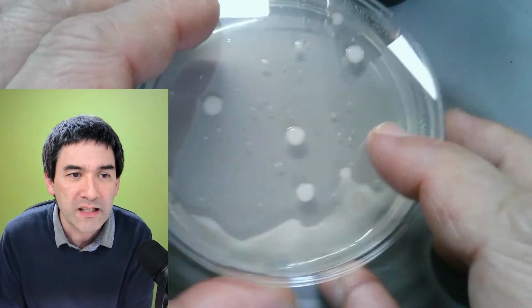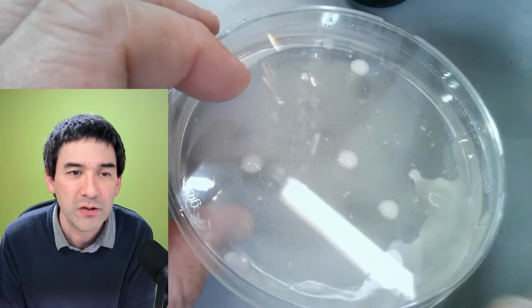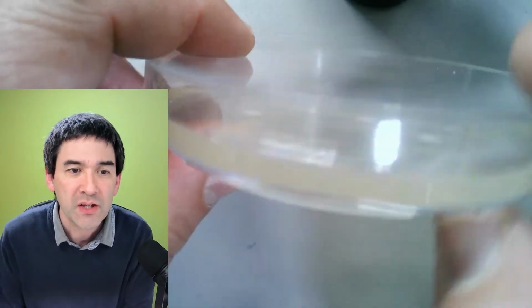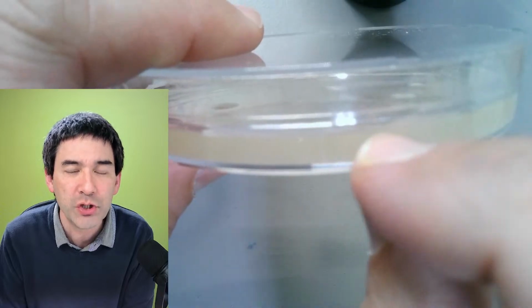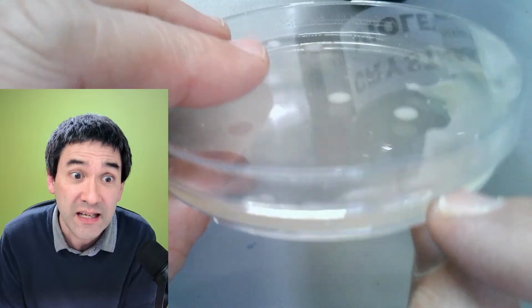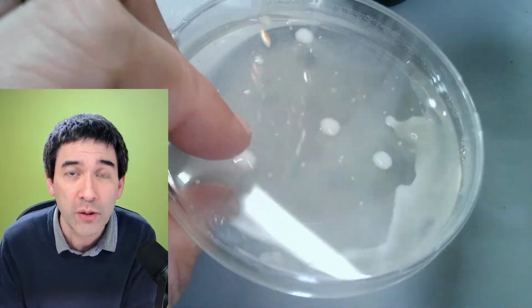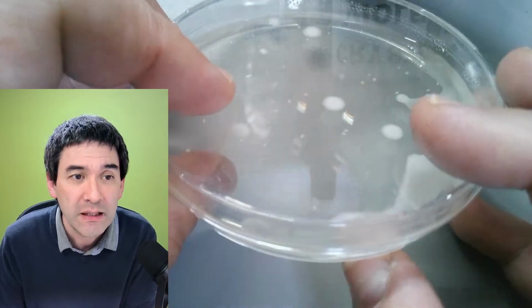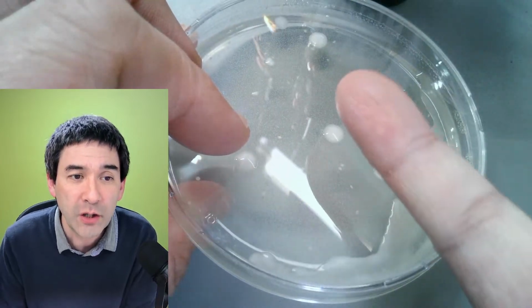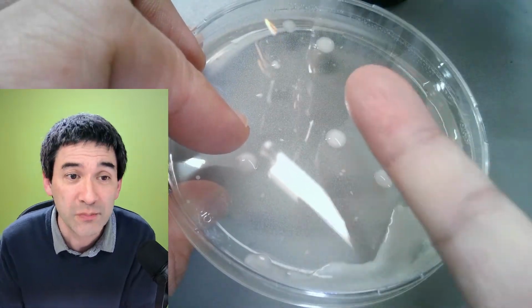So I will quickly explain to you, those of you who are completely new to microbiology, what a bacterial colony is. In this Petri dish, I've got a nutrient medium which contains nutrients like yeast extract, and also a so-called agar-agar, which makes it like a gel-like solid. And when there are bacteria on the surface, a single bacterium, you're not able to see it, obviously, because it's microscopically small.